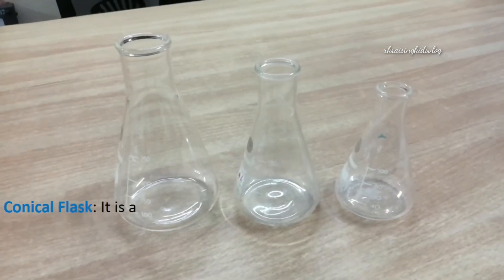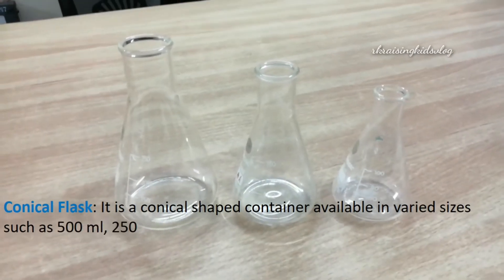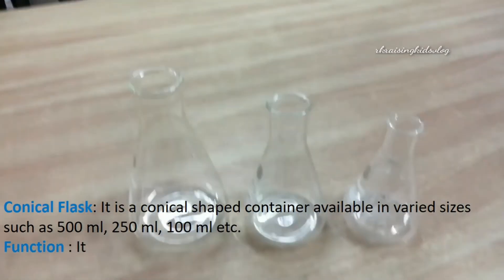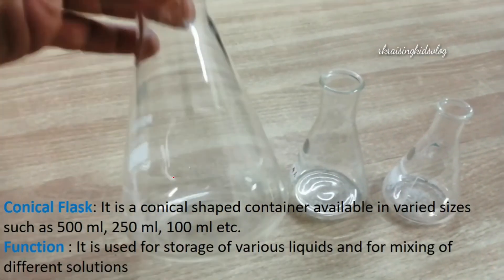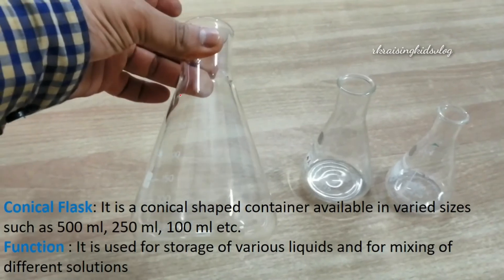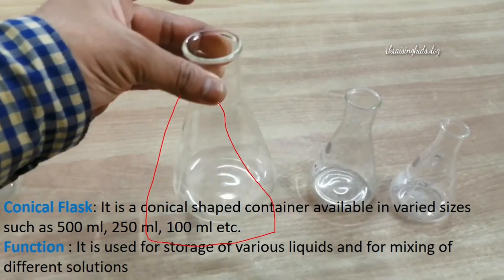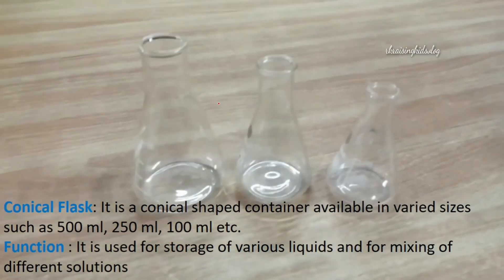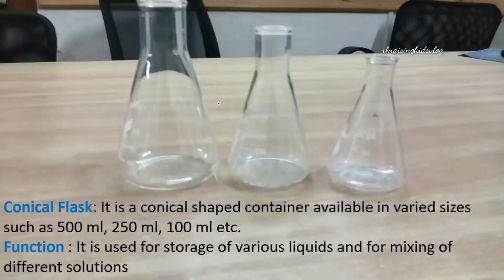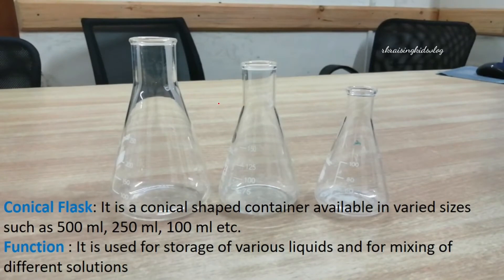Next, we'll know about the conical flask. It is a conical-shaped container available in various sizes such as 500 milliliters, 250 milliliters, 100 milliliters, etc. It is known as a conical flask because its shape is like a cone. It is used for the storage of various liquids and for mixing different solutions.